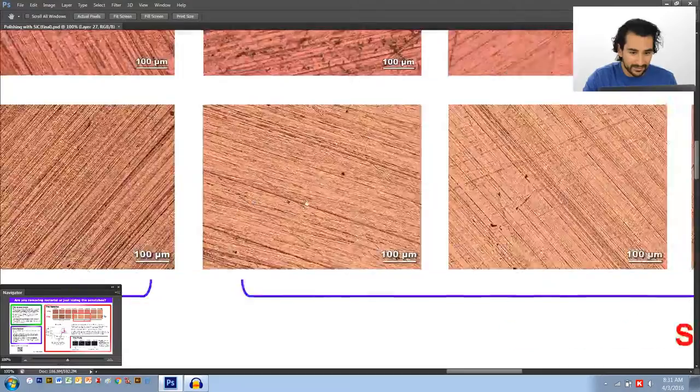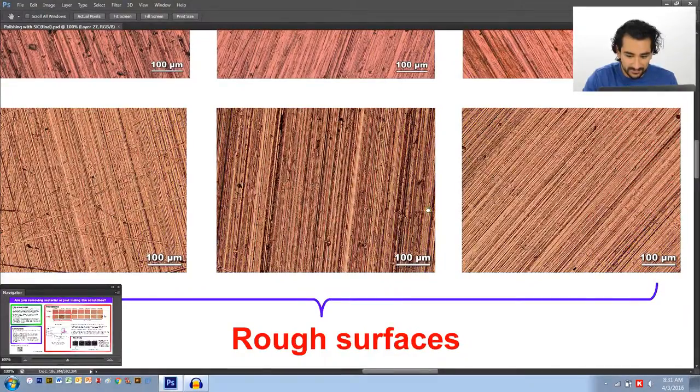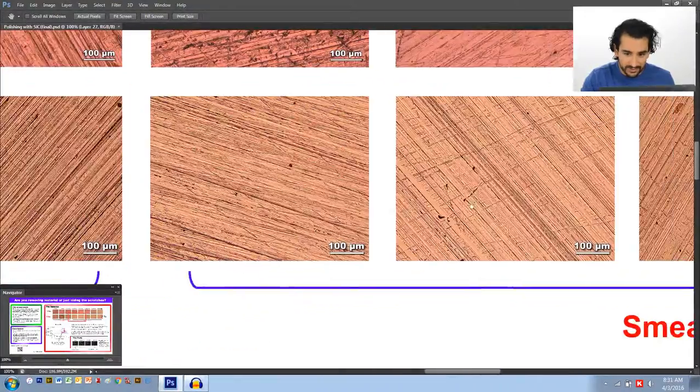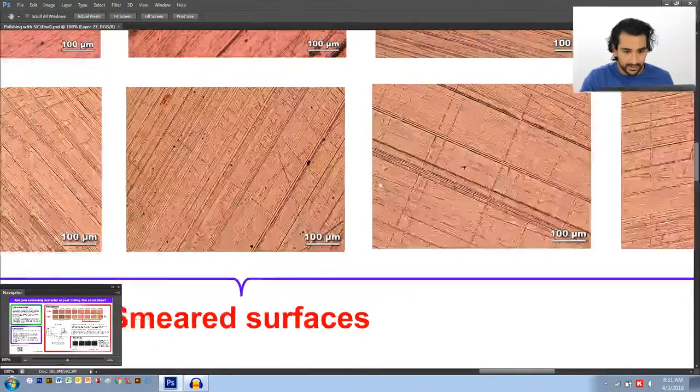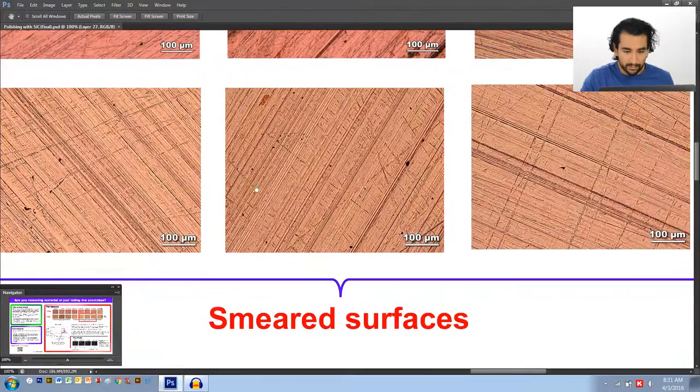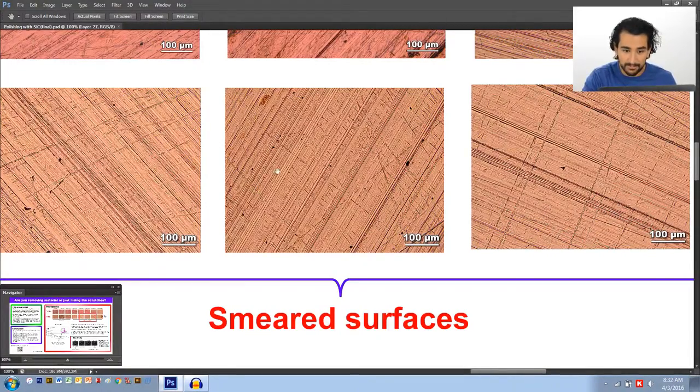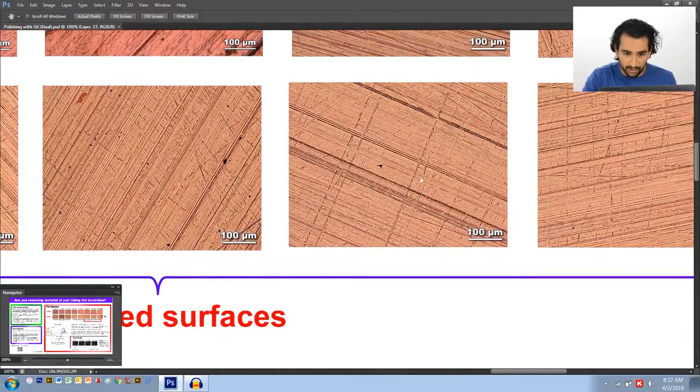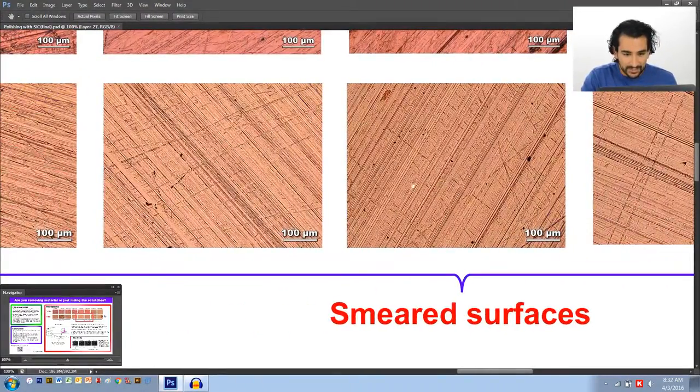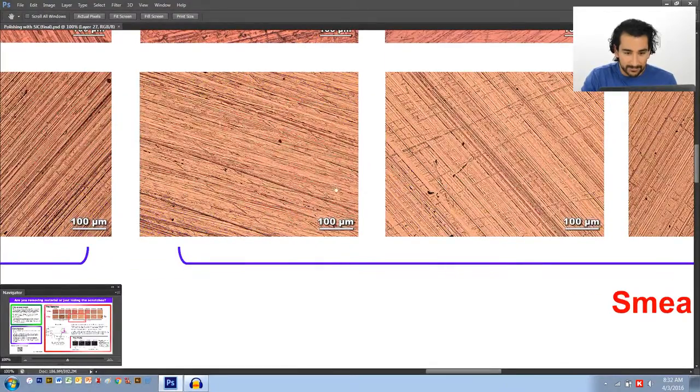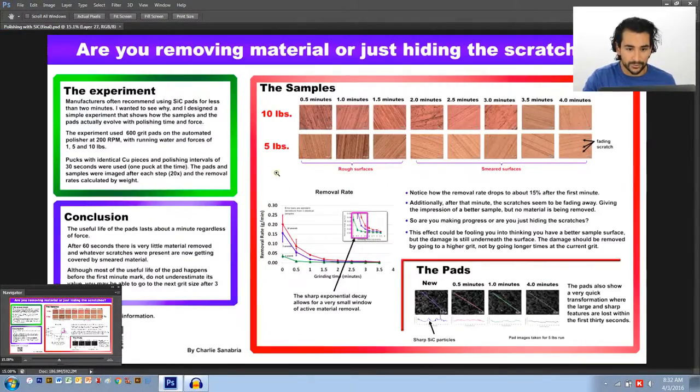If you're changing to a new pad after this, you'll just go back to this mess. So all the embellishing here that you did on the extra minute and a half or so is worthless. And if you think about it, well, the point of polishing, the point of step polishing is removing the damage from the previous scratches. It's removing material. So are you removing any material here? No. So don't waste your time. And I guess that's why the title is called, are you removing material or just hiding the scratches? Keep that in mind.